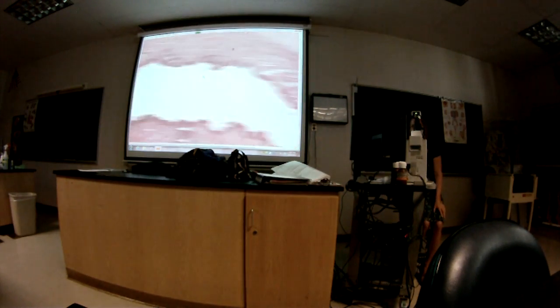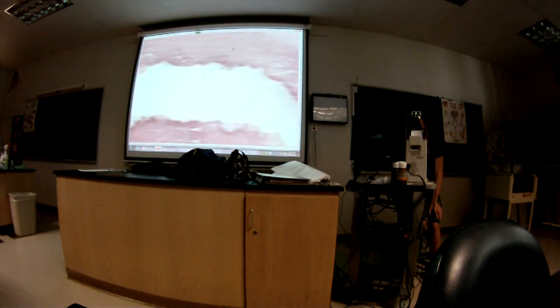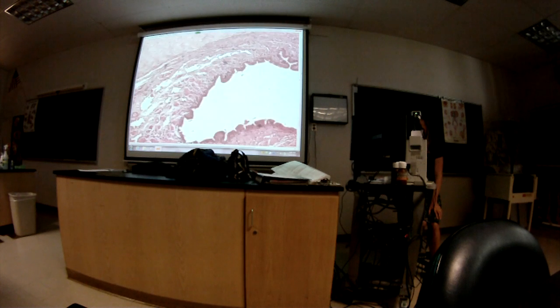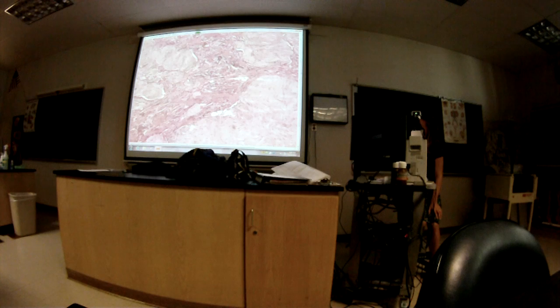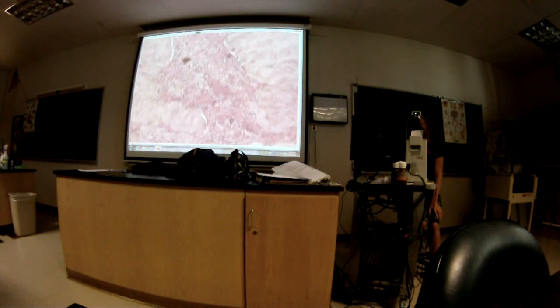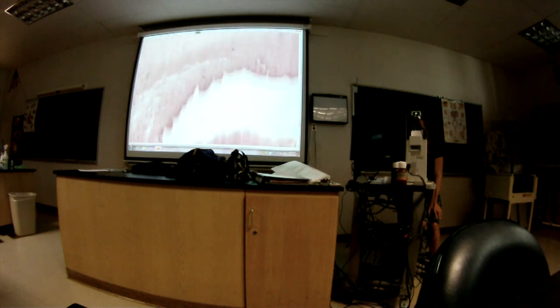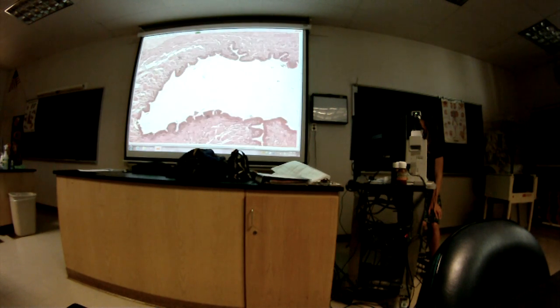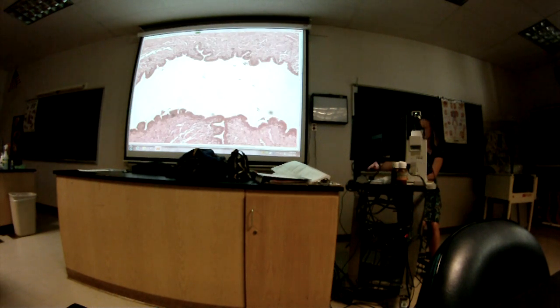Changing slides. Different slide. Alright, so this is what this slide looks like. Everybody looking up here? Okay. Question 5, what is the name of this opening or space passageway?